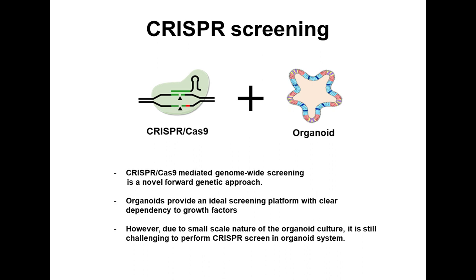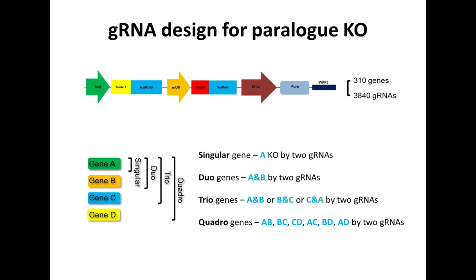So we were adjusting the two in a way that we can really find the well-matched size of the two. And we came up with an idea that just about 4,000 to 5,000 gRNAs is the one that we can really handle with a large organoid culture.